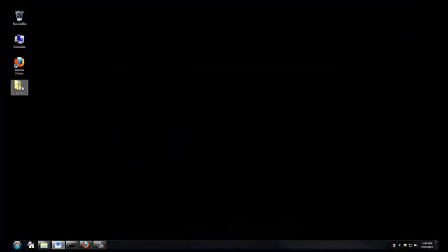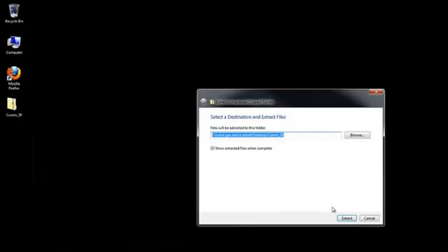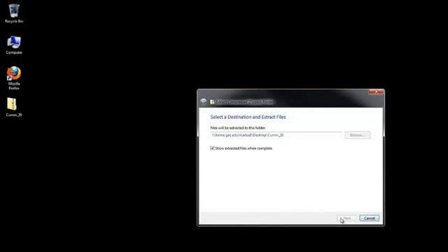And here it is, the zip file. You'll notice that it comes in a zip format, so it actually needs to be extracted before it can be opened in Topspin. So I'm going to right-click and choose Extract All and click Extract here.